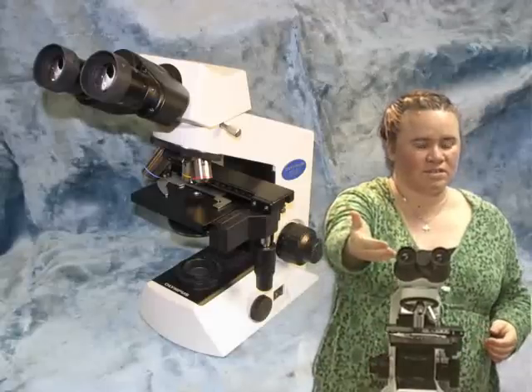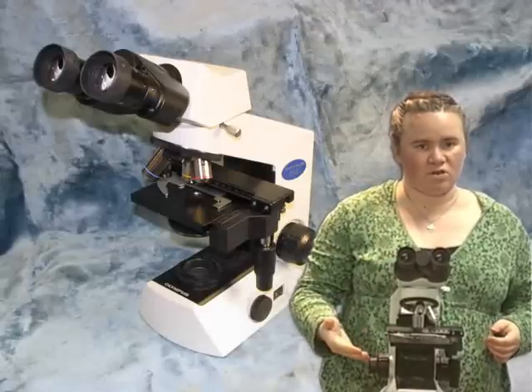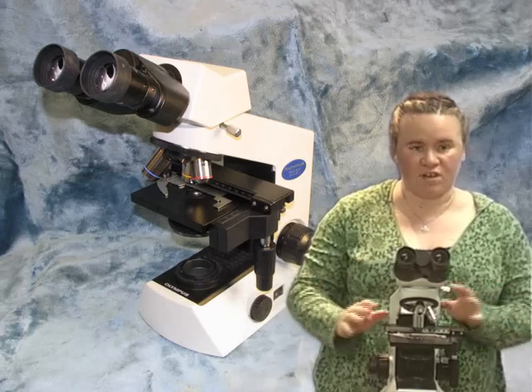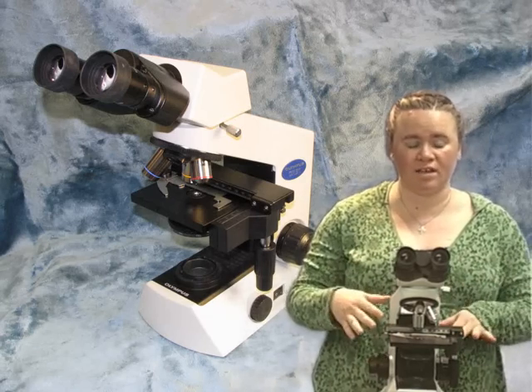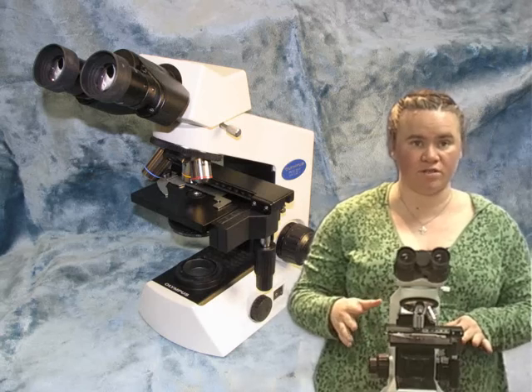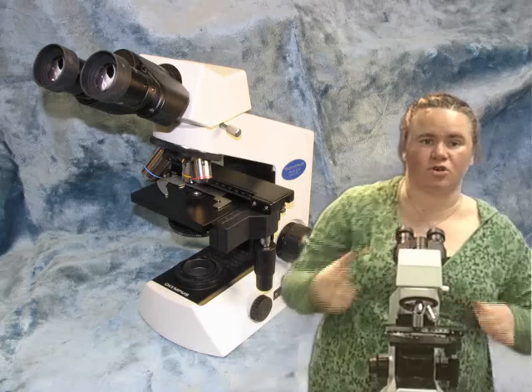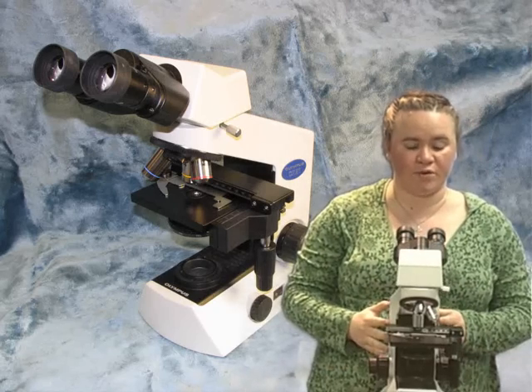Then you would look through the eyepieces here and reach to the back of the microscope to turn the adjustment knobs at the back, which is perfectly acceptable as well. It completely comes down to what you're most comfortable with. I'm going to turn this back around the other way so that I can show you some things on the microscope as we go through.